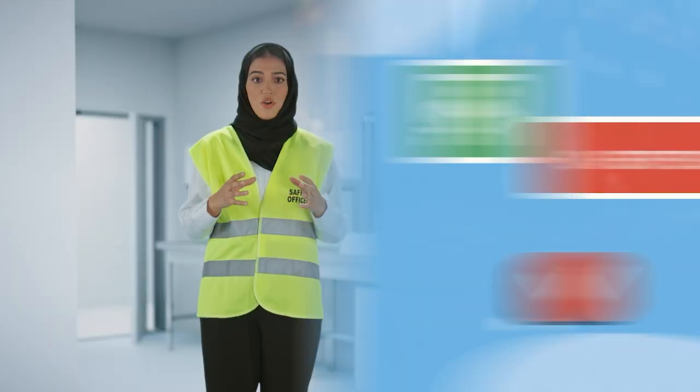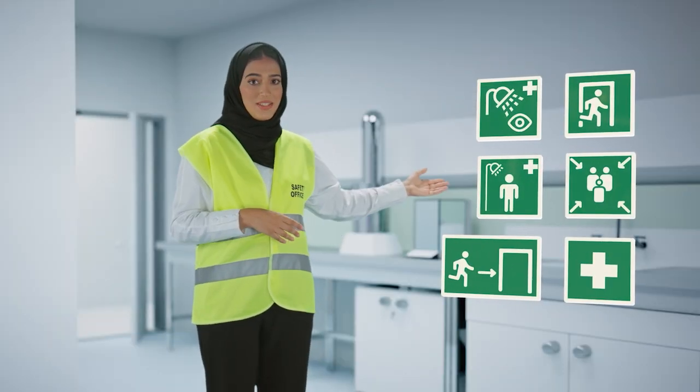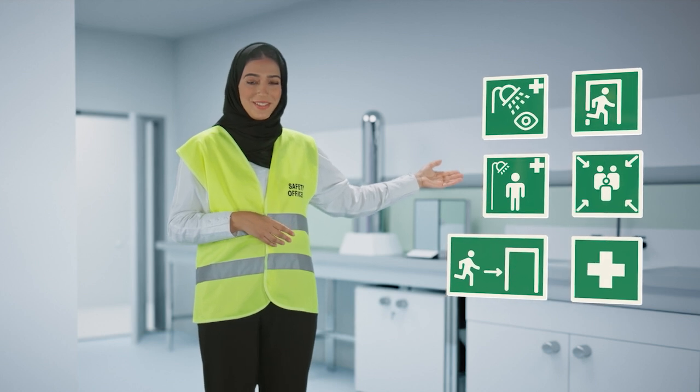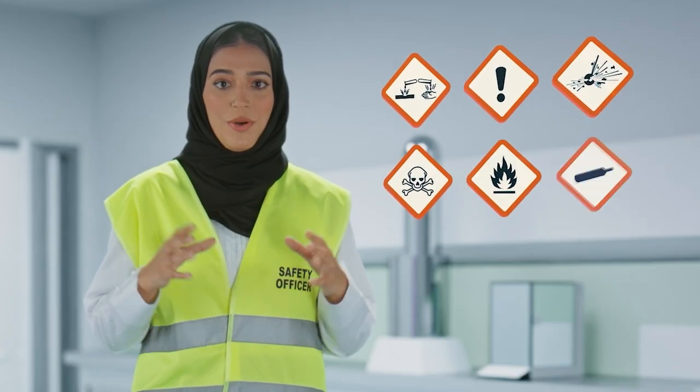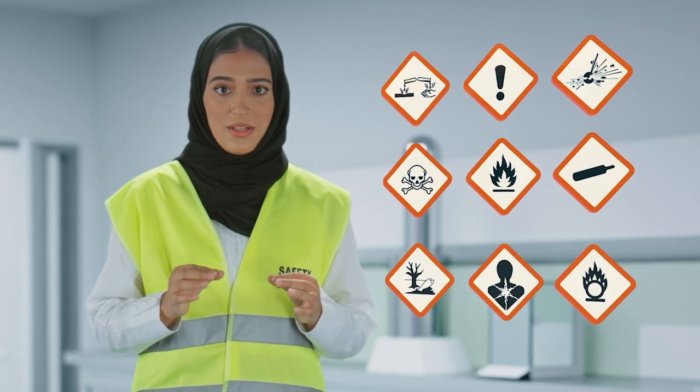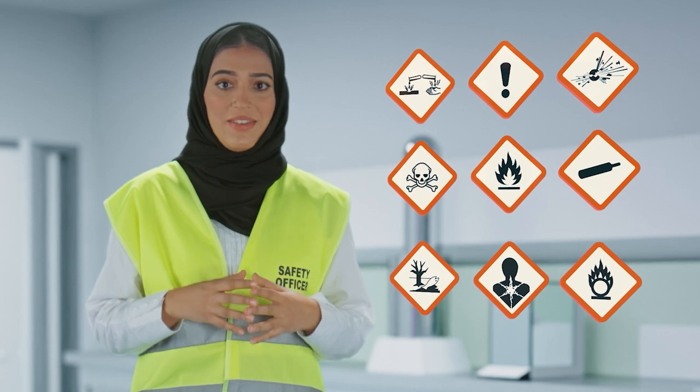It is essential to comprehend the safety signs and their meanings. You might see some of these signs around the building. Every chemical compound is labeled with its danger pictogram. They advise the chemist about the danger of the material. There are 9 various general health and safety pictograms altogether.